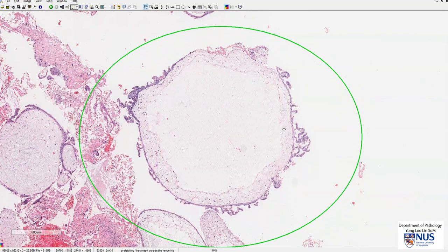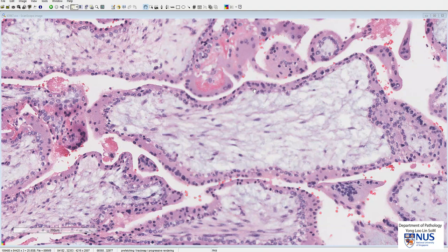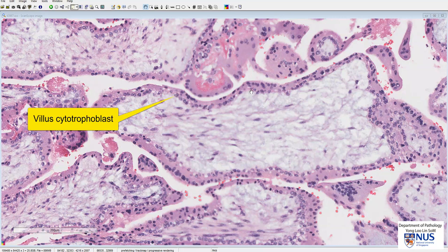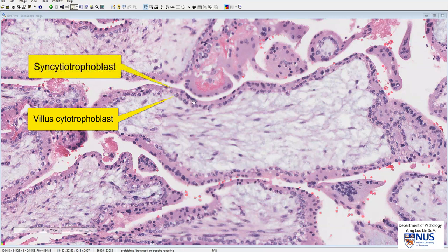The other abnormal feature is proliferation of trophoblastic tissue. For a quick histology recap: normally, chorionic villi are covered by an inner layer of cytotrophoblast, which is covered by an outer layer of syncytiotrophoblast where the entire layer is multinucleated. Both the cyto- and syncytiotrophoblast form trophoblastic tissue.